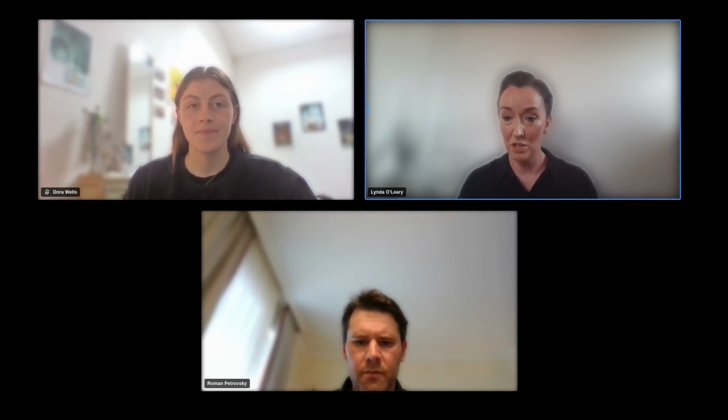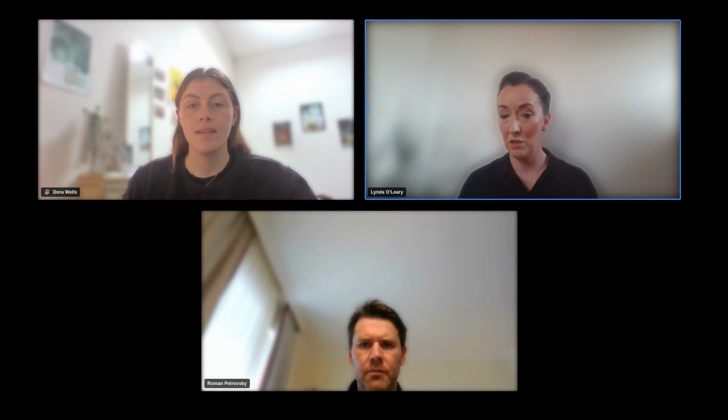Of course, if you want to, those individual images are always there that you can take them to third-party software. You can do some more advanced analysis if you wish. But because we are doing the analysis on the projected image, you can have the option to delete those immediately within a post run. So this will already save you some data.